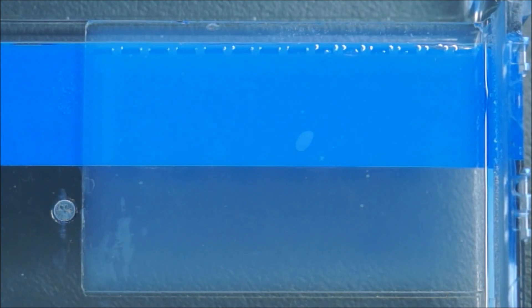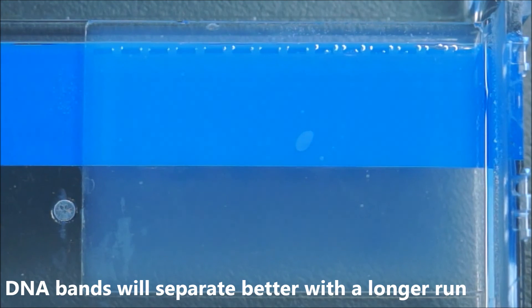Once the blue dye has run off the edge or it's just about to run off the edge, you can turn off the machine and take your gel for staining.